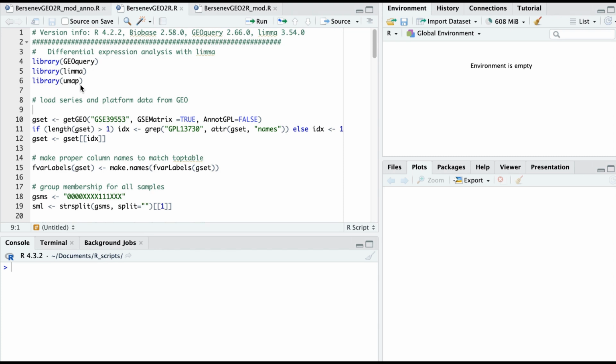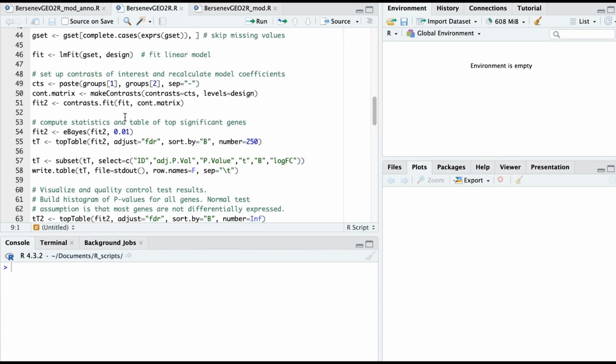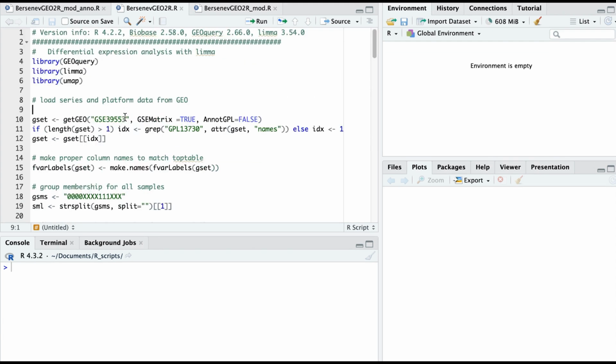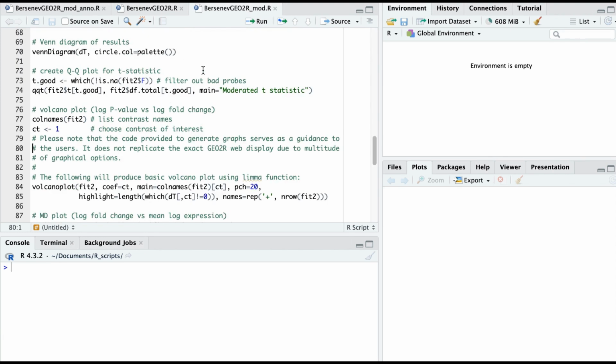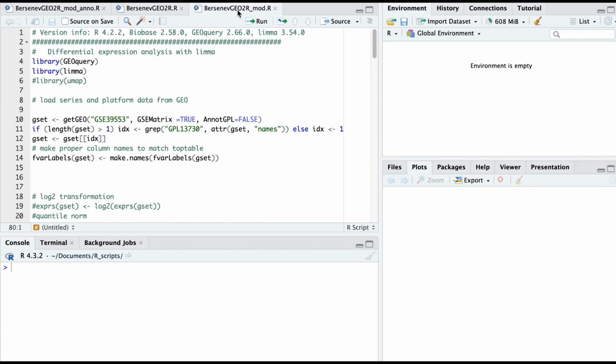After you copy paste the script to RStudio, you have to save it. You give some clear name, what it is, where it's from. This is the original version without any changes or modifications. And I previously told you that I prefer to do modifications and simplifications, and then I save it as a different file name.